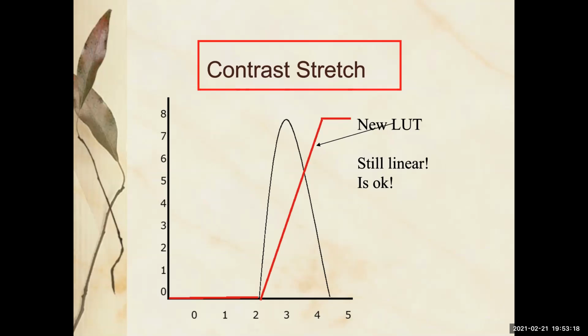So here is a very commonly used trick in image processing that you're going to use so much once you realize you can do this. It's called a contrast stretch. So what you're doing is anything in the dark black, dark gray levels that you didn't use, you're just sort of lumping them in and calling them all 0. And really, in this case, 2 is the new 0, right? You're just saying, if it's 0, make it 0. If it's 1, you know what, make it 0.